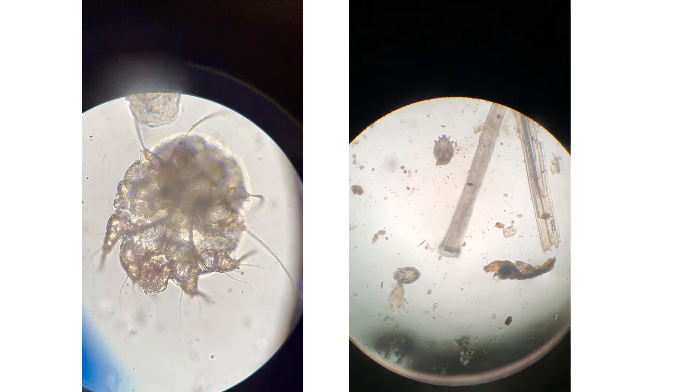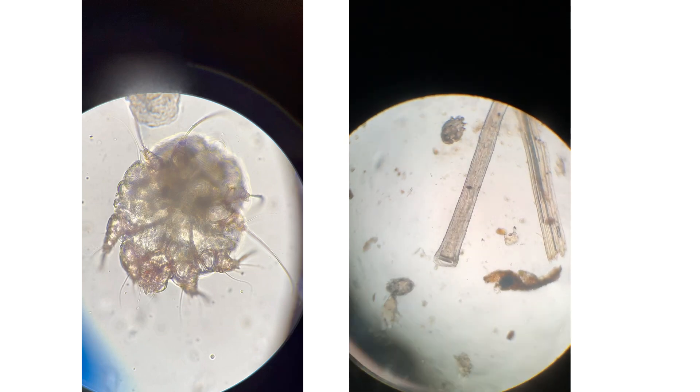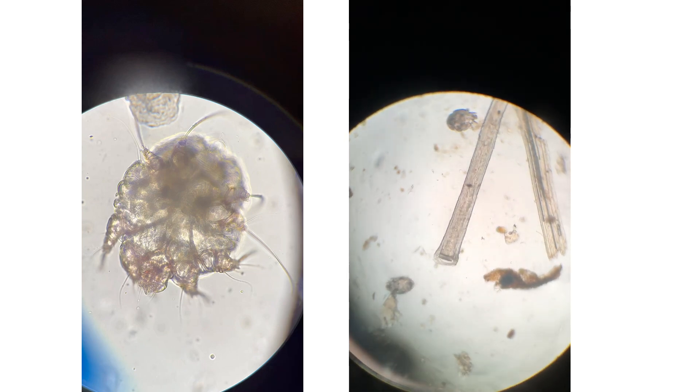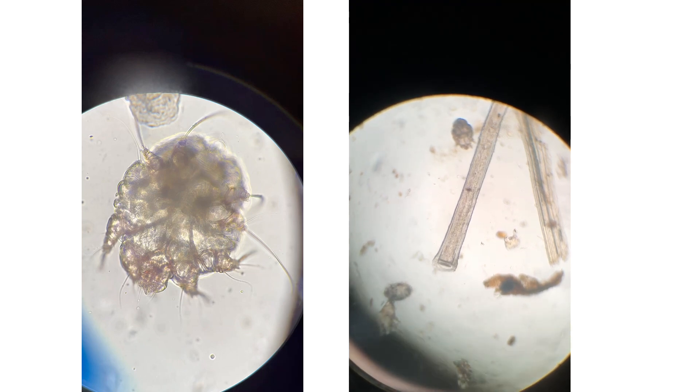The sarcoptic scabiei mite. The first clip is of the mite at 400 times magnification. It is showing some of the internal structures as well as the suction cups on her feet that help her hang on to the host.